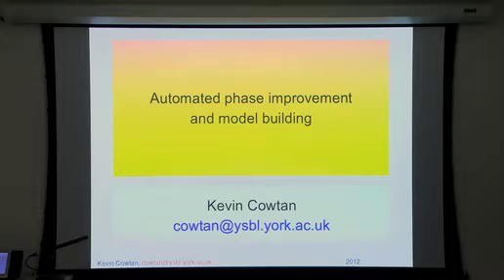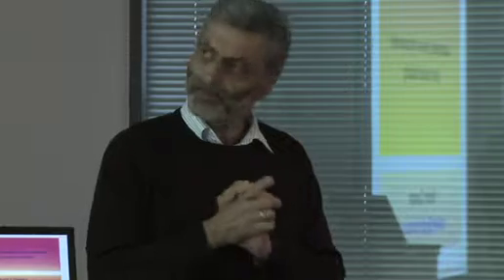The next lecture in the course is going to be given by Kevin Cowtan. We are going to talk about model building also, a bit about the automated model building. Phase improvement, map improvement, averaging, and so on.